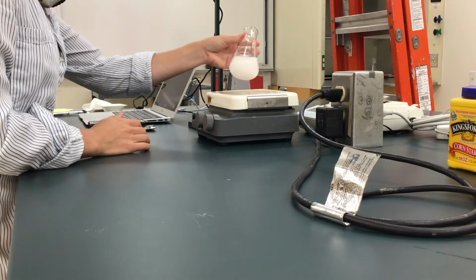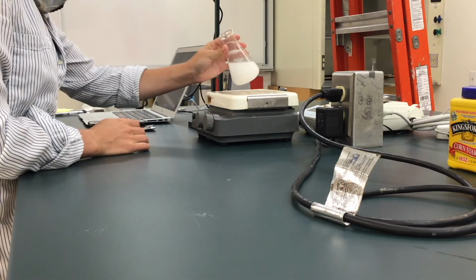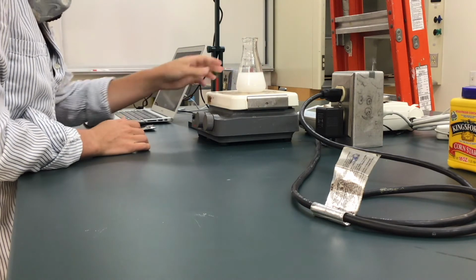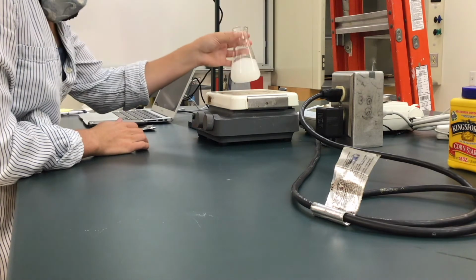Now you can see your solution is more opaque than clear. It's because the cornstarch will not completely dissolve. But this is the solution that we're going to use.